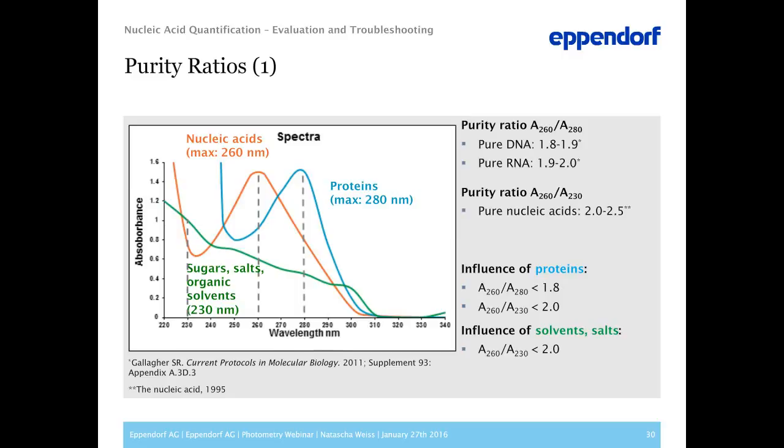On the other hand, ratios from literature are ideal ones, and there are diverse samples like body fluids or soil samples which will never meet these values. So the ratios are helpful for determining the quality, but they will not replace your own rating on sample quality resulting from your experience.